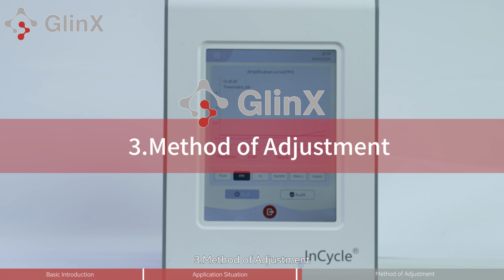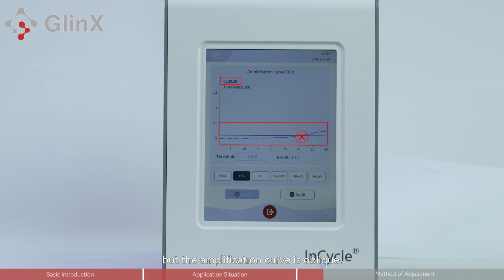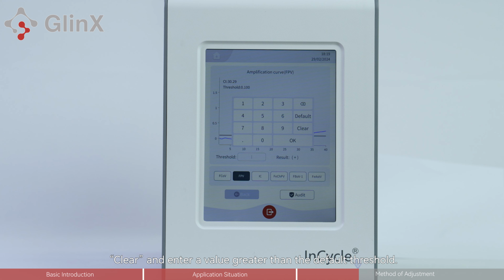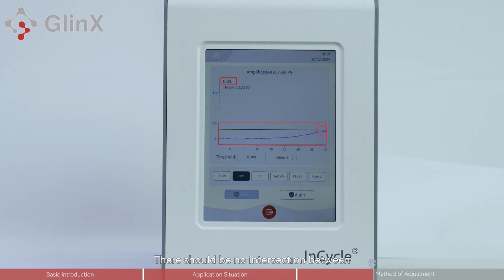3. Method of adjustment. If the test result is positive, but the amplification curve is oblique, the threshold should be adjusted upward so that it has no intersection with the amplification curve. Click Threshold, Clear, and enter a value greater than the default threshold. Click OK. There should be no intersection between the threshold line and the amplification curve, and the CT value will change from a specific value to no CT.